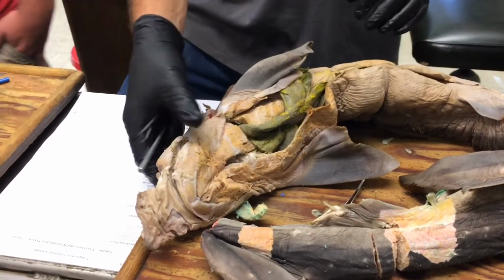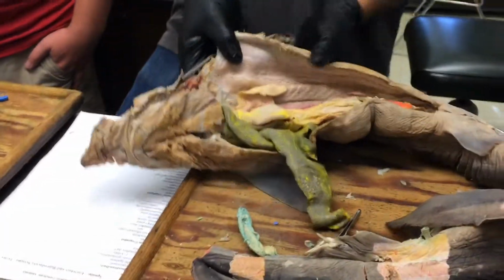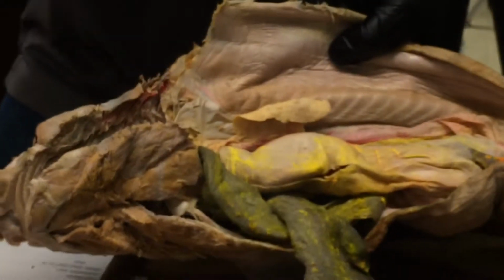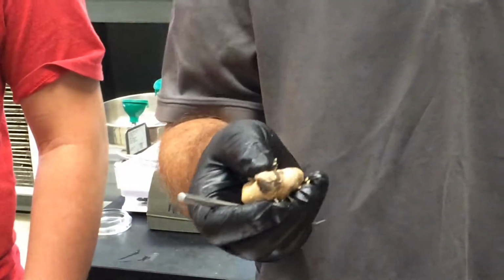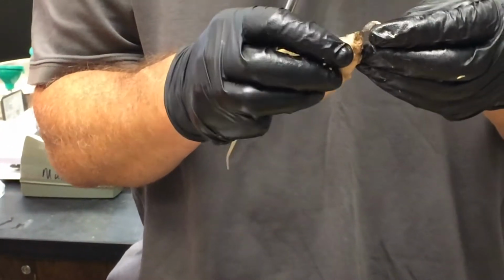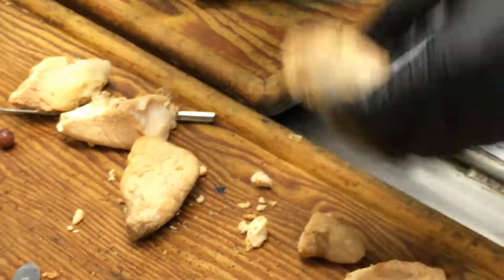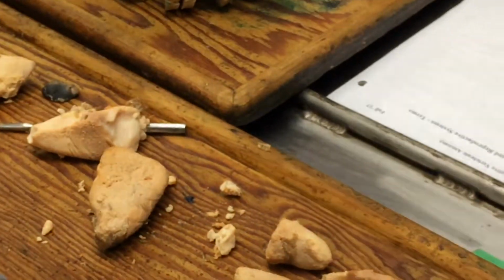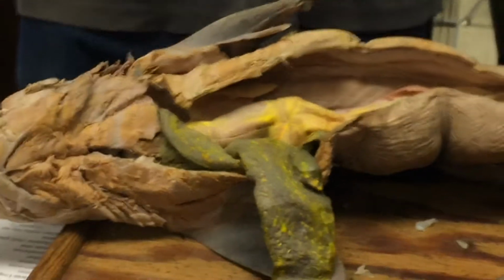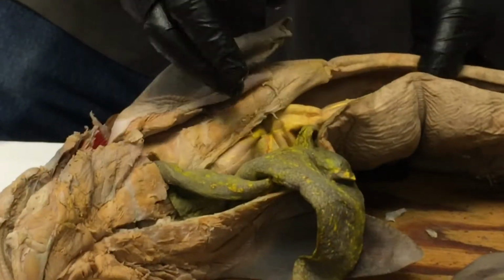Okay, so this is a female, and she had, as you can see, a lot of eggs in her. And these eggs had embryos probably, but the embryos were not big enough to really be noticeable. What is this? I think that is the embryo. Kept seeing flakes of those everywhere. I think that may just be the membrane. Are you seeing anything obviously embryo-like? But there were definitely embryos there, because the eggs wouldn't be in the uterus already unless they had been fertilized. But they were just probably very tiny, and you can't see them with the naked eye.